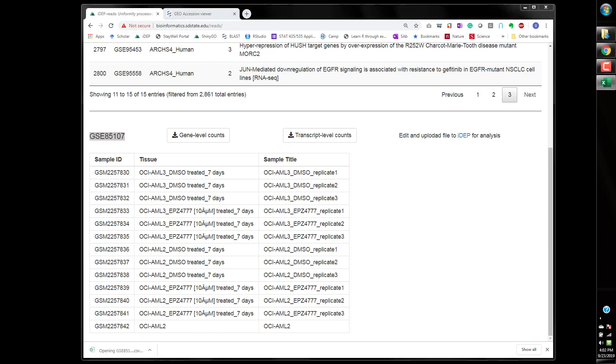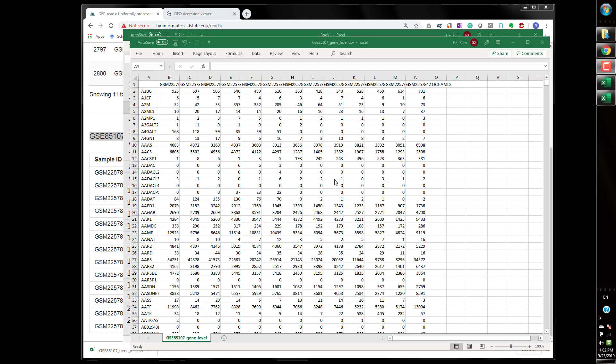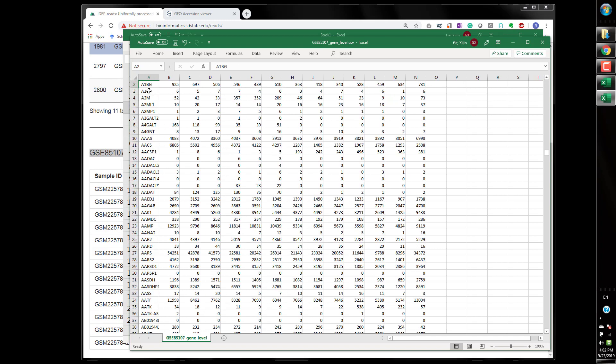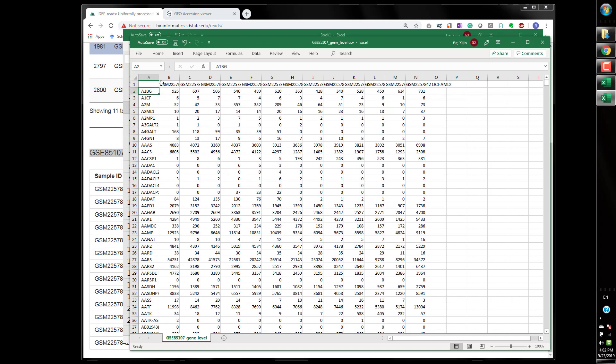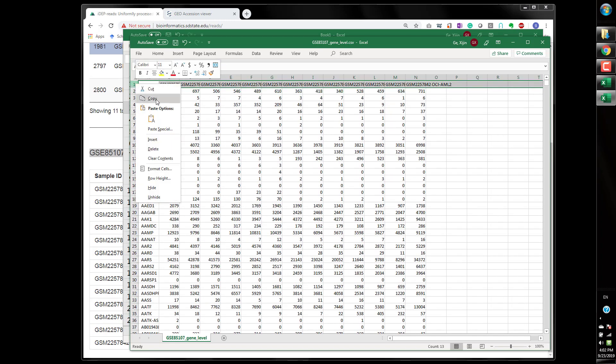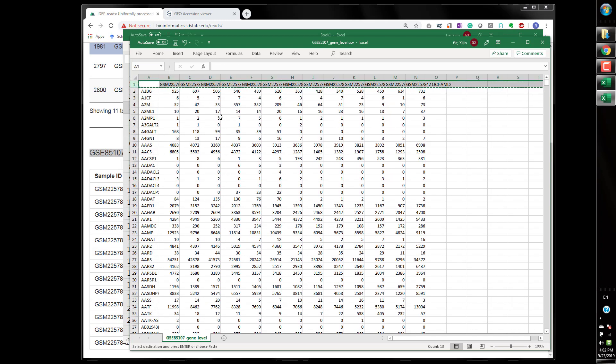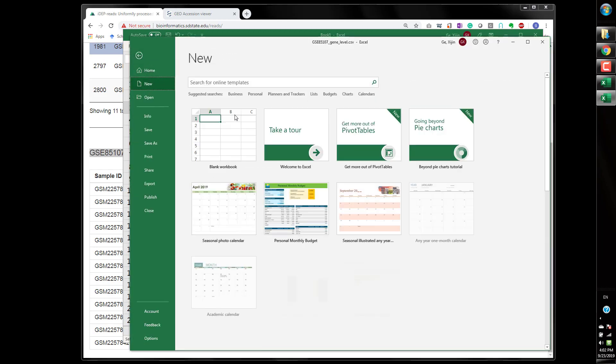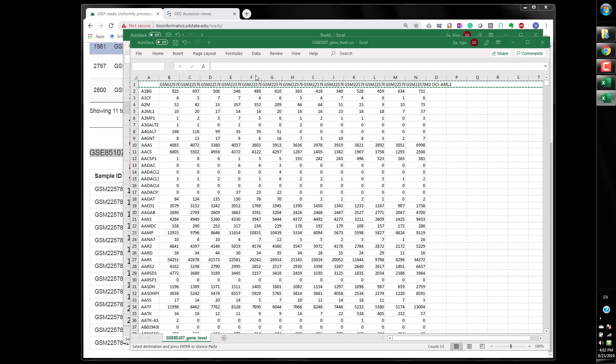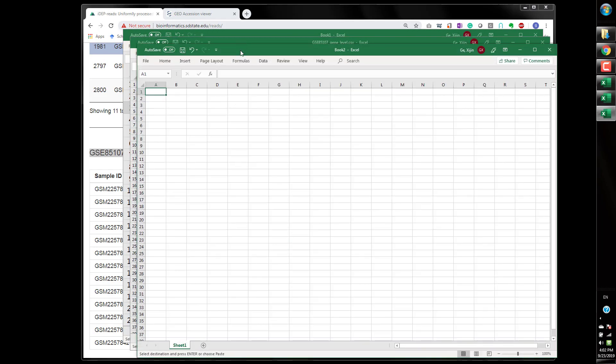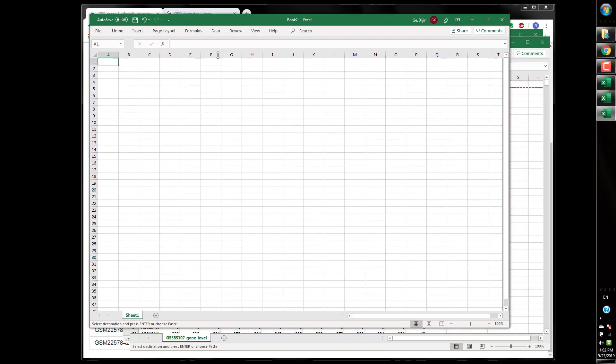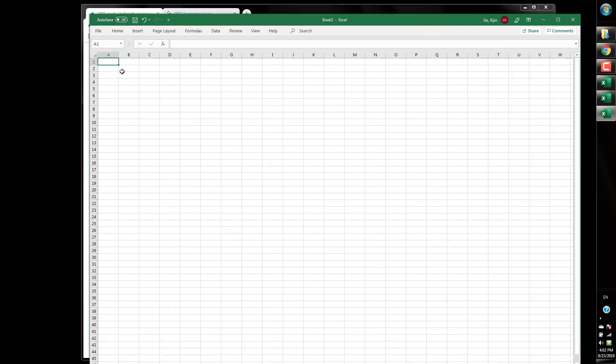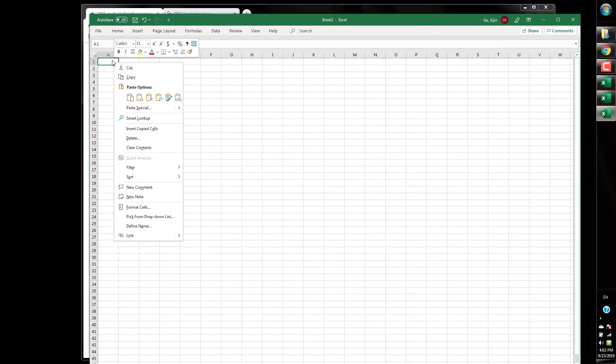So I just opened and this is the data as you can see we have 13 columns and 58,000 rows and the first thing I do typically I'm going to clean up the sample title a little bit.